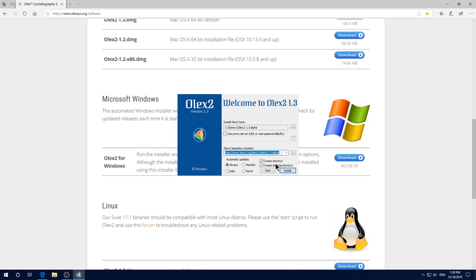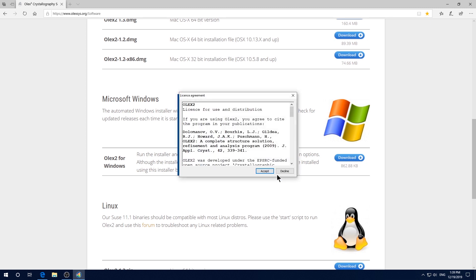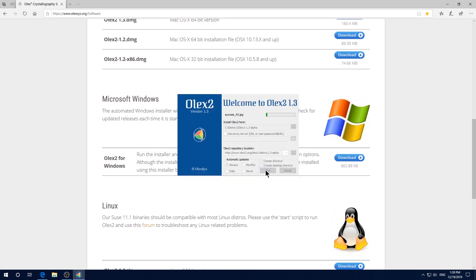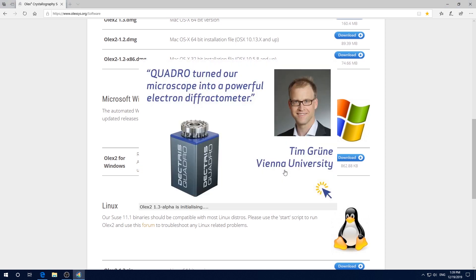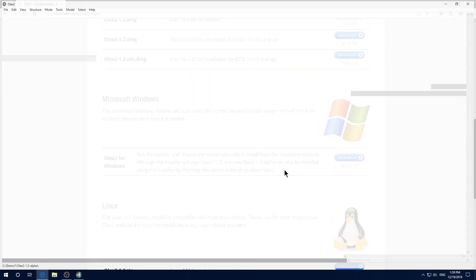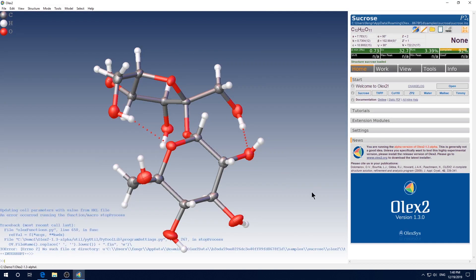You can leave the rest of the option as default, then click install. Click accept. Click run. You will see a sample structure in the screen. Looks beautiful, right?